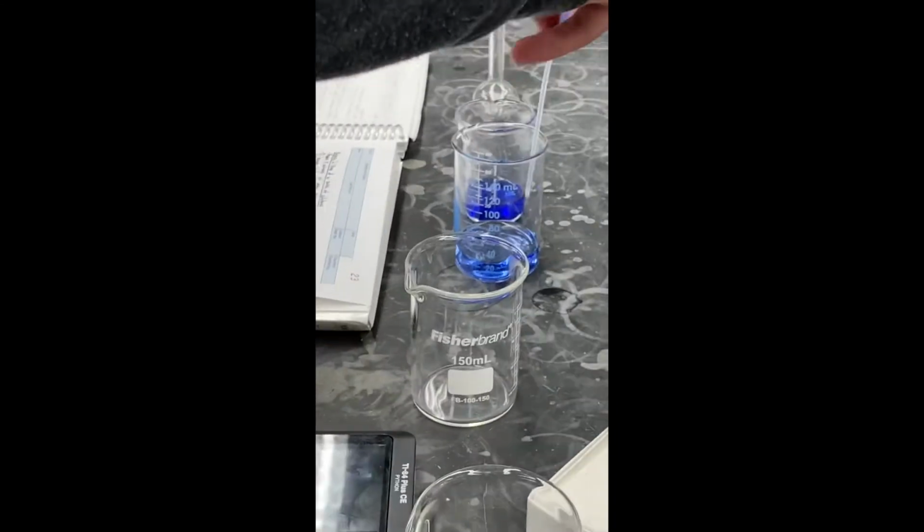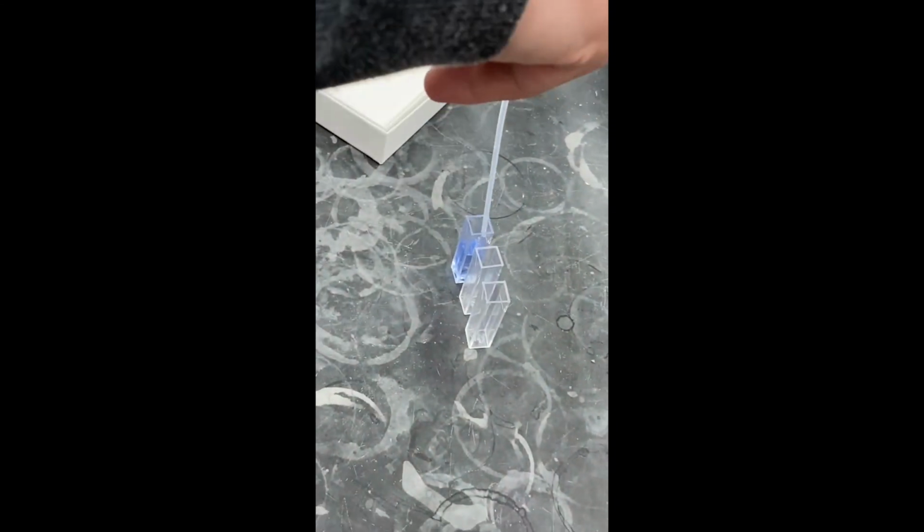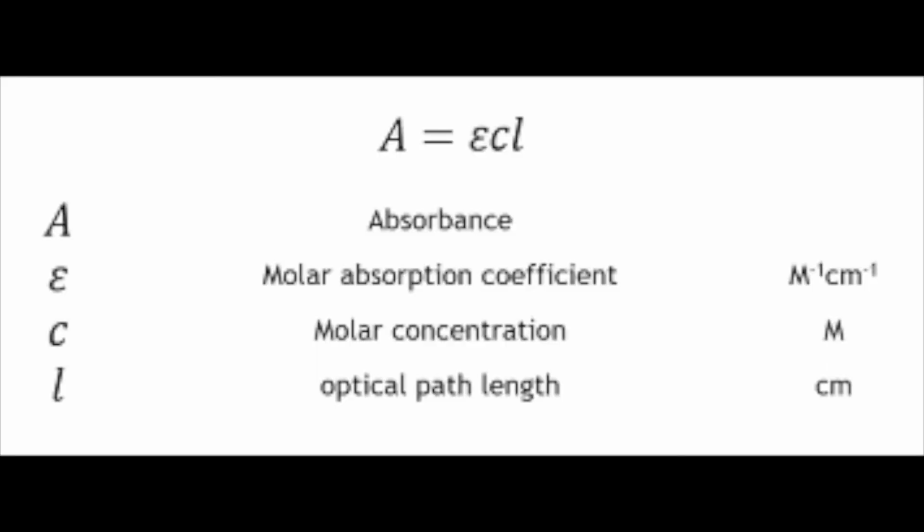We then filled cuvettes with all the solutions we made, water, and the unknown solution, and headed to the spectrophotometer. We went to the spectrophotometer because it measures absorbance by shining light through it. We planned to find the absorbance for our knowns first and create a graph from Beer-Lambert law.